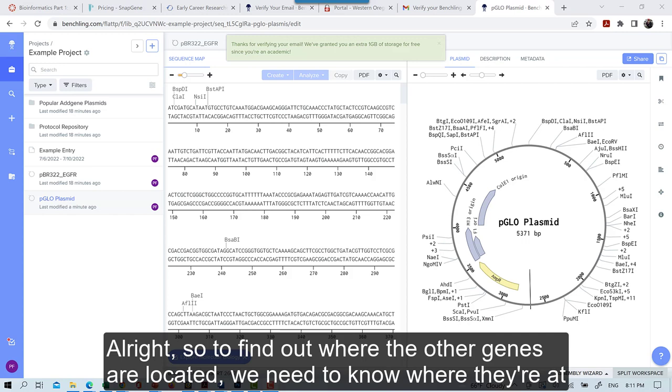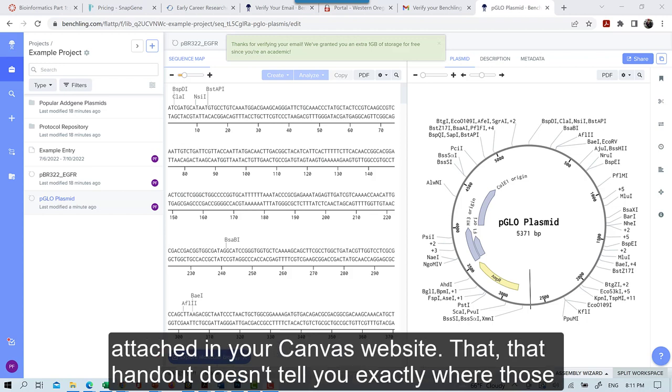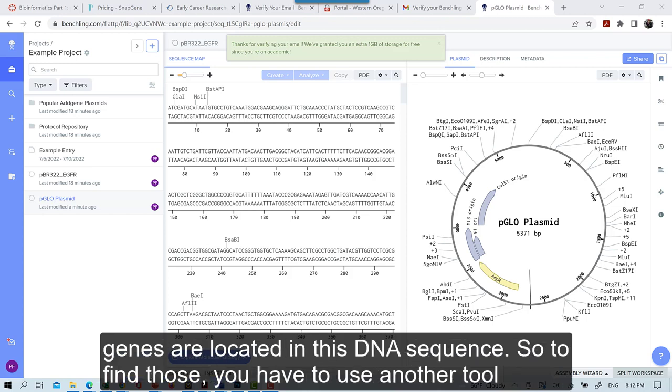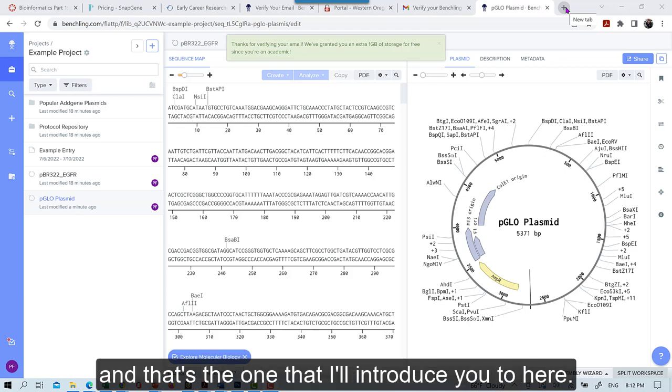Alright. So to find out where the other genes are located, we need to know where they're at within this sequence. And you'll notice when you look at the BioRad handout that I also attached in your Canvas website, that that handout doesn't tell you exactly where those genes are located in this DNA sequence. So to find those, you have to use another tool. And there are many different tools that you can use to do this, but I like one that's called ORF Finder.